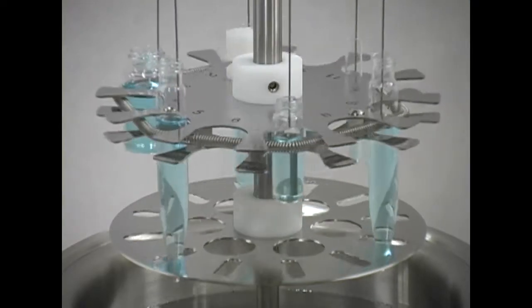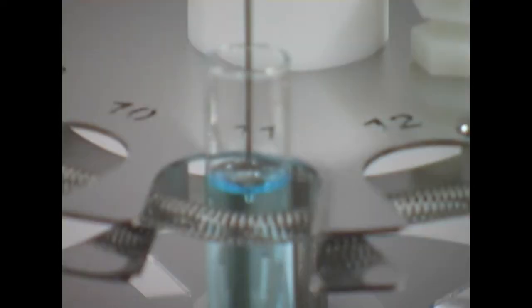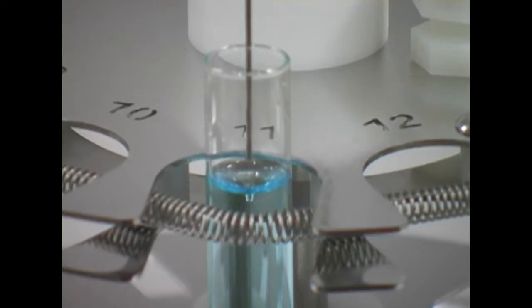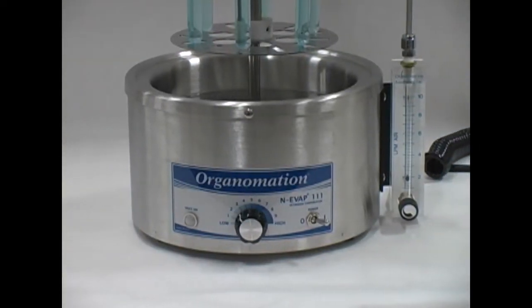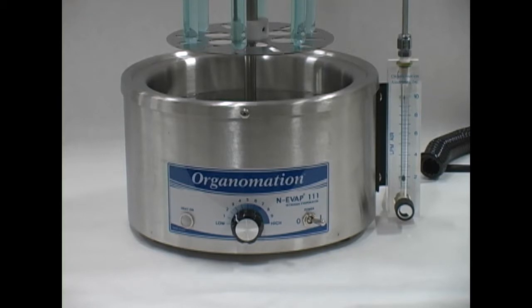The N-EVAP line provides controlled concentration of samples using a combination of nitrogen gas and a heated bath. The standard 6-Position model comes with a popular water bath option which provides reliable, uniform heat.